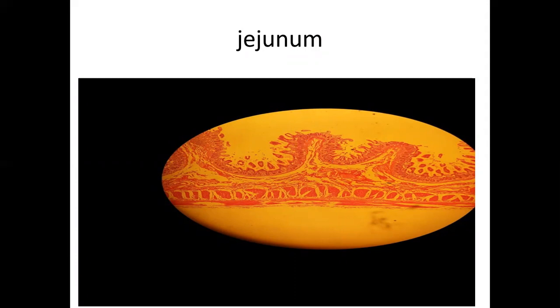تمام. زين number 2 اللي هي راح تكون each one هذه كلياتها هي plica circularis. Each one of these, هذه اللي تكون evagination from it, هذه هي راح نسميها بالvilli.